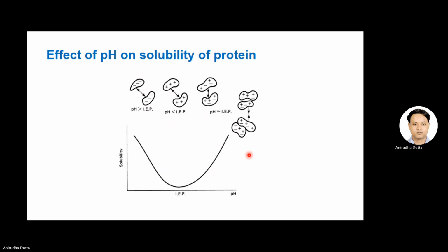So using salting out, we can purify or extract protein. Like if we add a particular concentration of ammonium sulfate salt, it will precipitate the protein of our interest, and we can resolubilize that protein by removing the ammonium sulfate salt. Another thing we learned from this last part is that the presence of a high concentration of salt enhances hydrophobic interaction. So how can we use these two pieces of information for further purification of a particular protein?